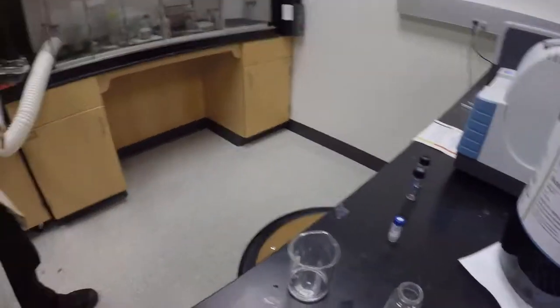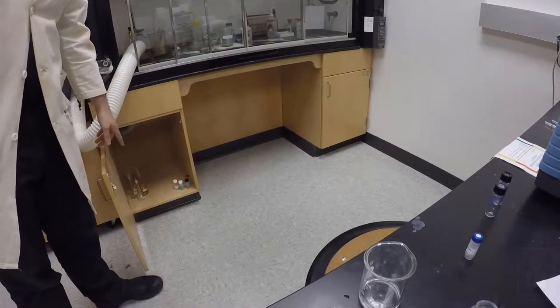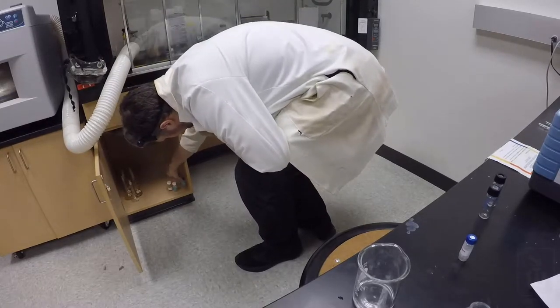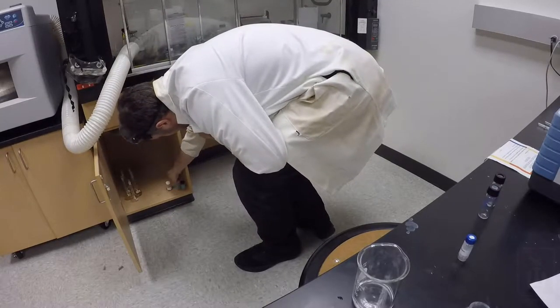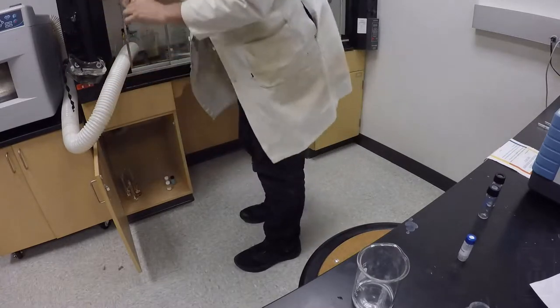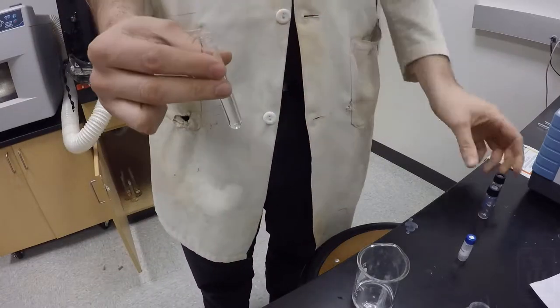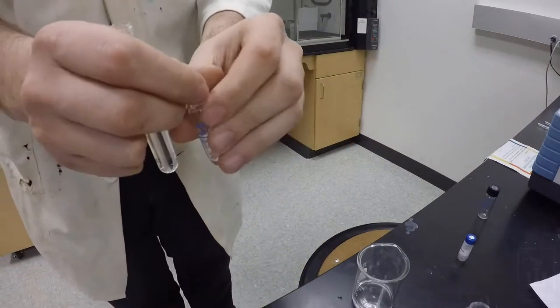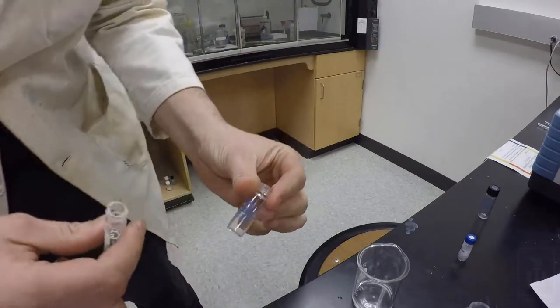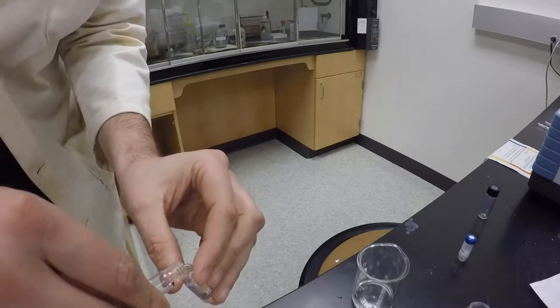So if you look over here under the hood, I got some methanol and some hexane. Some methanol here. So all I need to do is fill it up to the minimum solvent level line. You can go a little bit above that if you want. Nothing fancy.